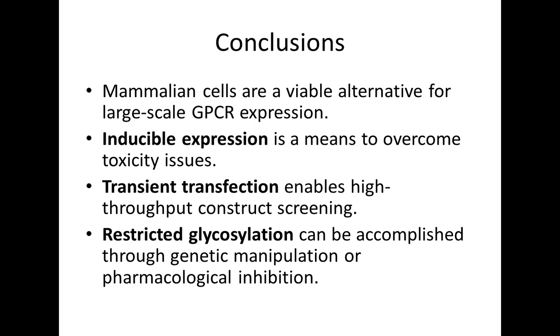This next one I'm going to paraphrase. I'd like you to help me with it. Can you not perform lipidation on insect cells? Right. So insect cells do. For example, a lot of GPCRs have palmitoylation sites, and insect cells do palmitoylate it. But usually, in our experience, the percentage of receptor that gets correctly lipidated is lower than it is in mammalian cells.